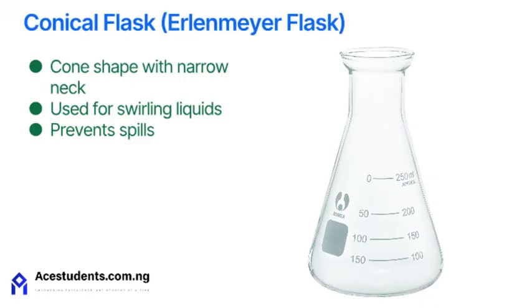Conical flask. A conical flask is ideal for mixing without spilling. The narrow neck also allows for heating with reduced evaporation.